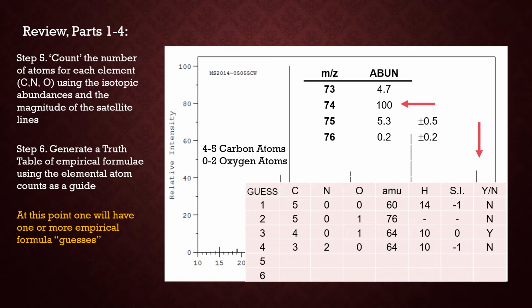We want to reduce that number downward, and that's the role of the fragments. Secondly, we're going to use supplementary spectroscopic data, namely NMR and IR, to further reduce and refine our interpretation.